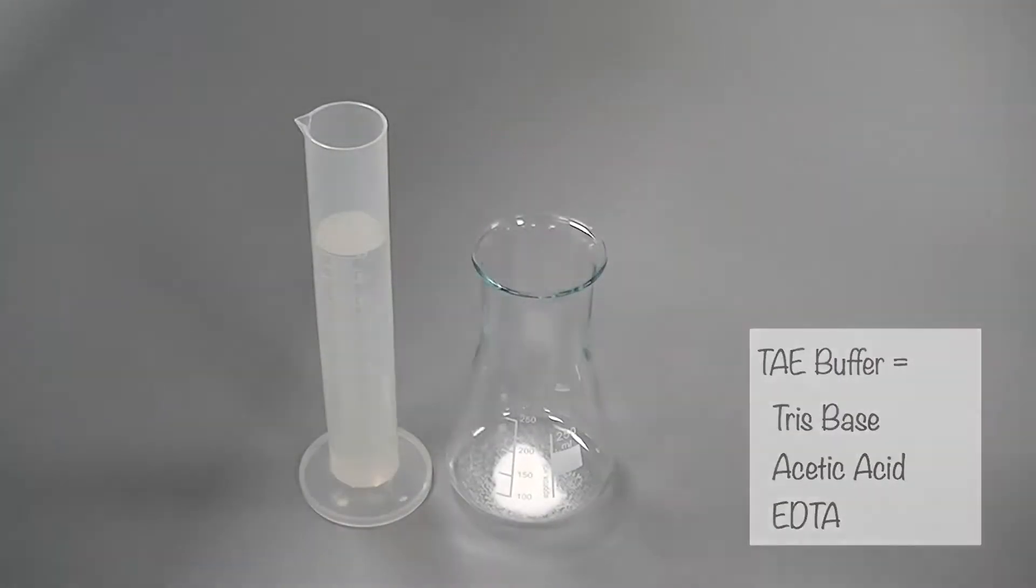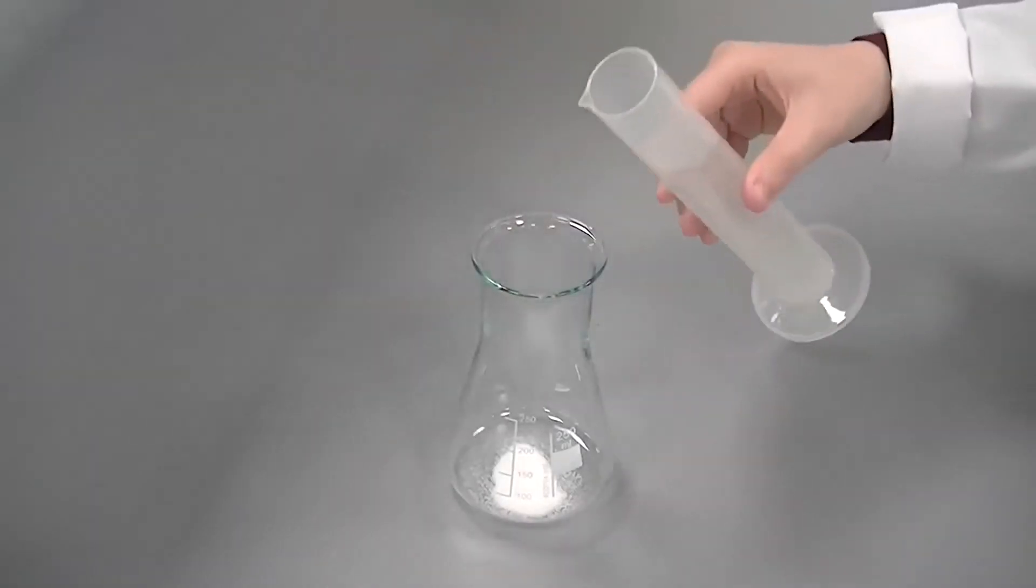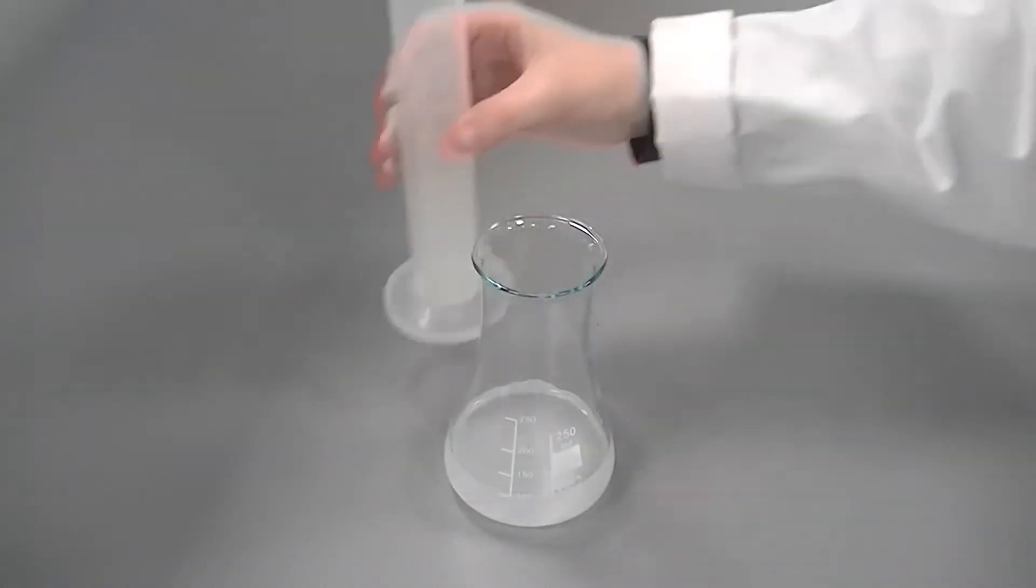In this video, we are adding 100ml of TAE buffer to 1g of agarose powder to make our 1% gel.